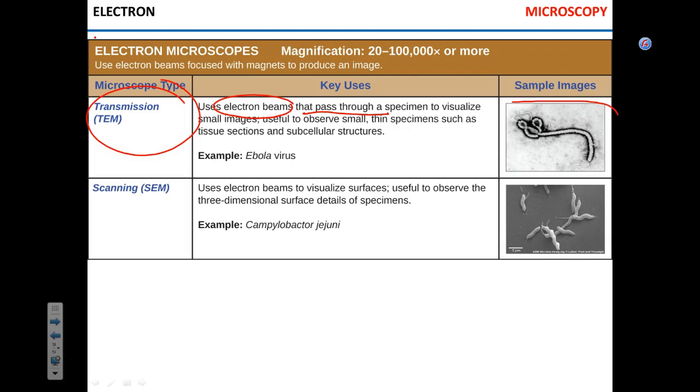This is one of the famous transmission electron microscopy pictures. It was taken, I believe, in 1972 by Frank Murphy. It's an image of Ebola virus. Now, you can see that this image is two-dimensional, truly two-dimensional. It's a section. Do we agree on that? You can kind of see what's inside the virus, but you can't really fully appreciate its form. You understand what I'm trying to say?